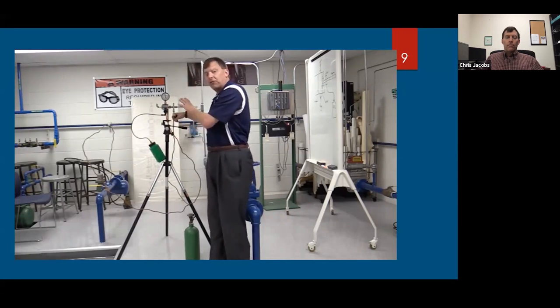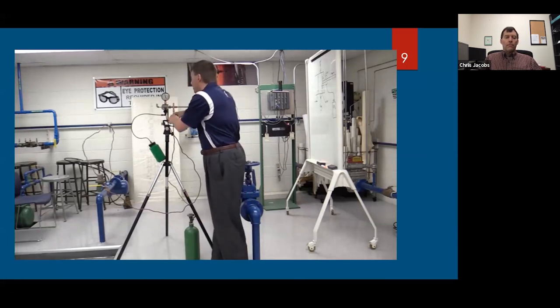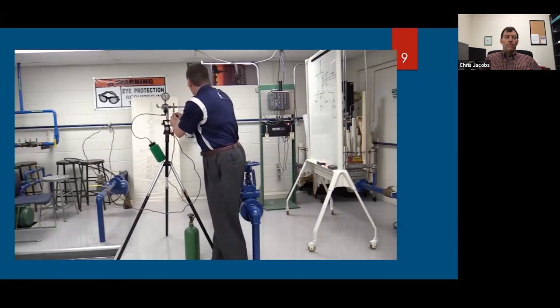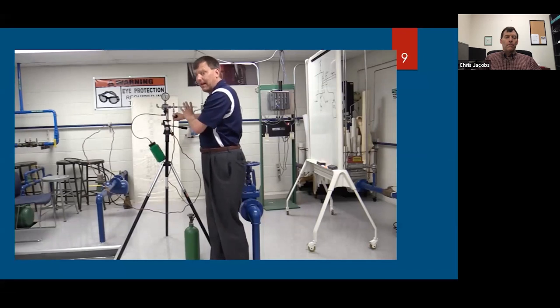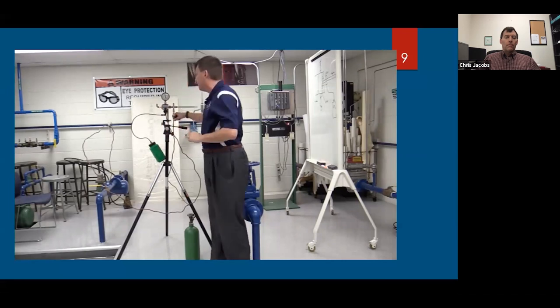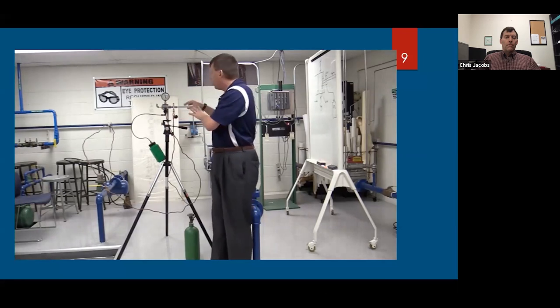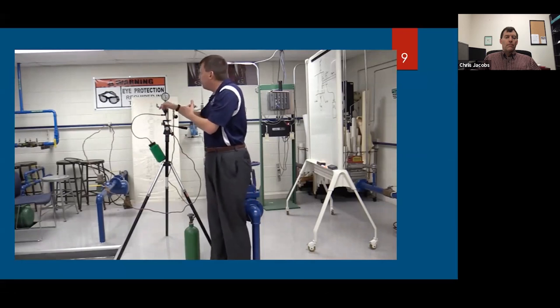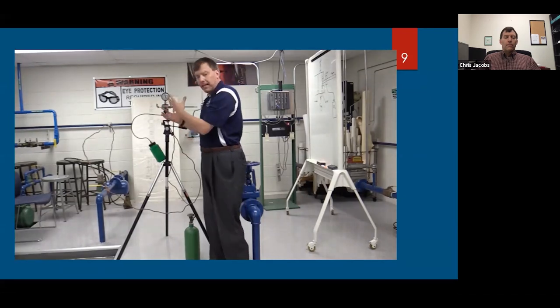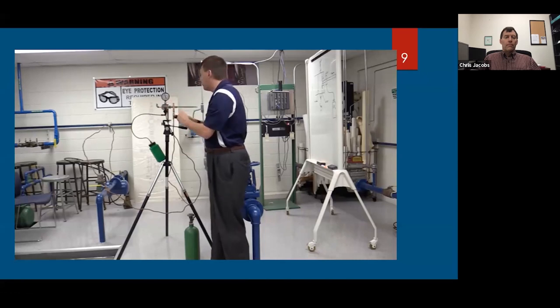Once I start to see the first droplets form on the chamber mirror, then I will note the temperature. Okay, I pre-chilled it before, so I didn't have to go down from room temperature. And now I just saw some droplets form. I look over at the temperature. It is 62 degrees. Now what I will do is leave the carbon dioxide off and let it warm back up again. I will note the second temperature, when the final droplets disappear from the chamber mirror. And I will take the average of those two temperatures, which will give me my initial dew point.